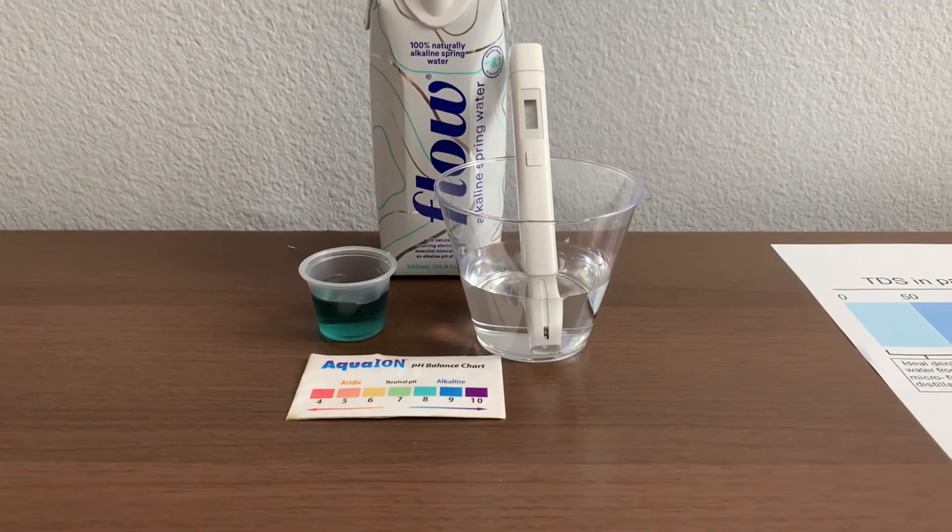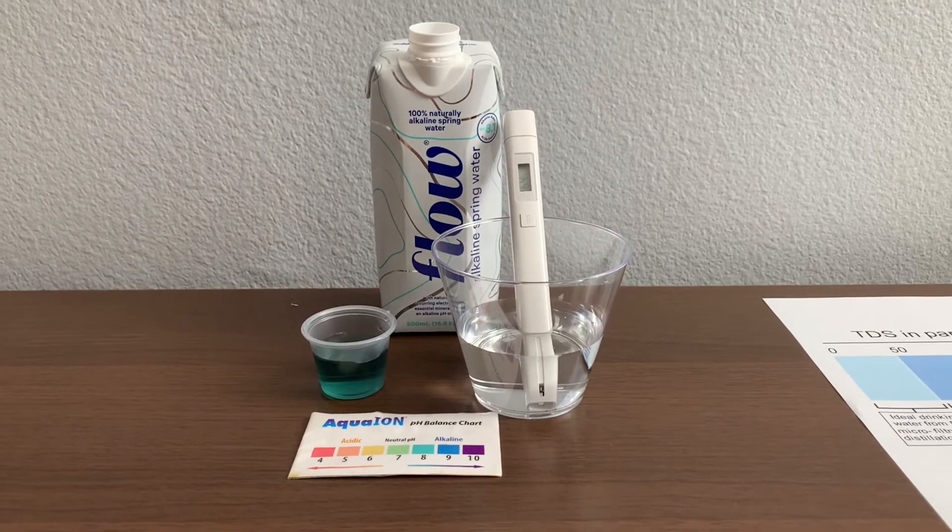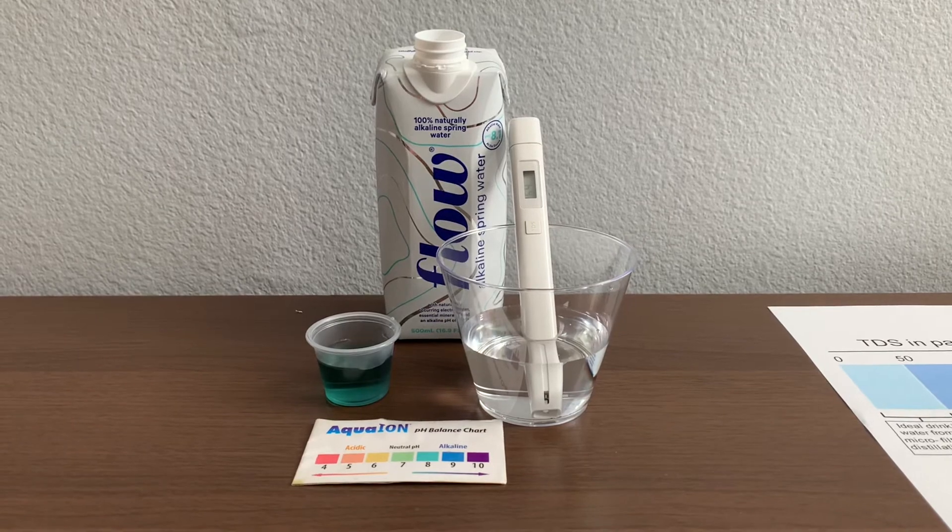I would say that these were around the same. The pH was exactly the same, and the TDS was around the same as well.